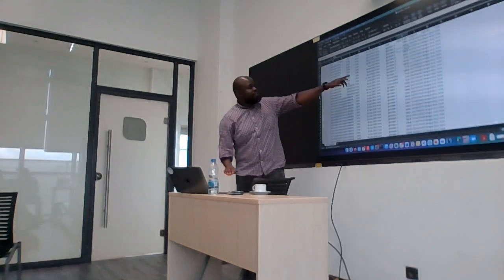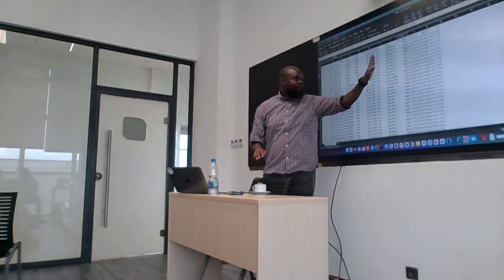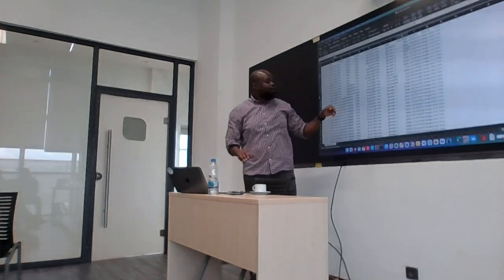Here I even have the sequence length, then I can even filter, for example, these ones that are too short and say, well, I don't need that or something, and such kinds of information, okay?